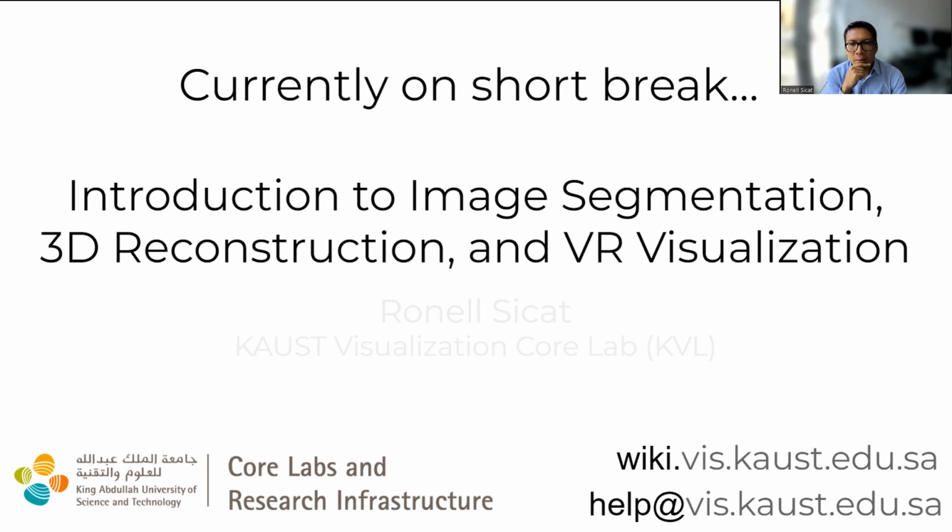But later on in the last part of the workshop, I'm going to show you how you can use virtual reality on your own machine, but you would have to do a bit more steps than just a few clicks. And we'll see that in a bit, okay?